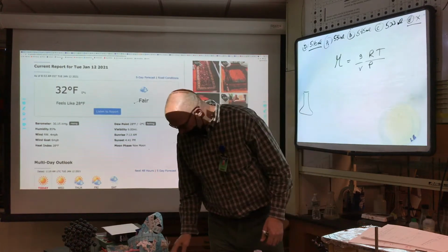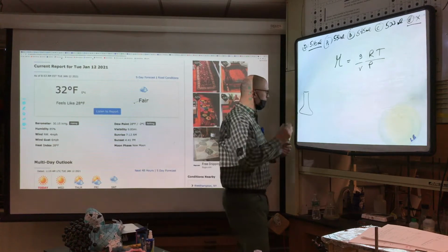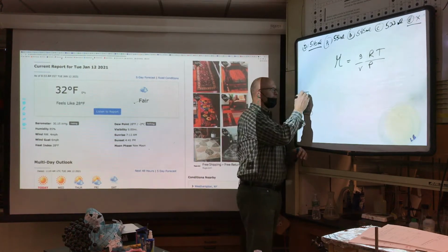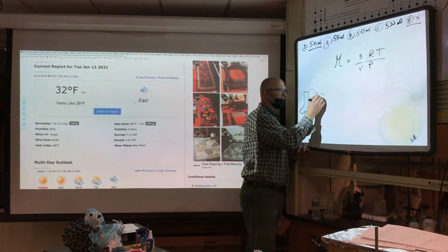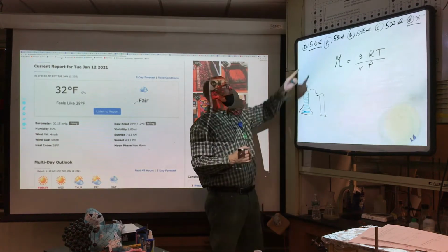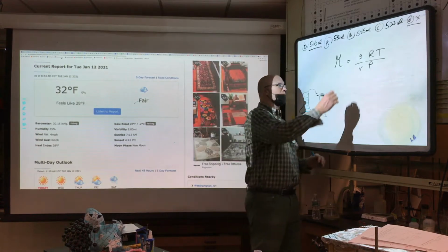It's green, but hey, maybe there's algae in it. In any case, they filled it up with water to the tippy top, and they poured it into a graduated cylinder and measured the volume of that space. The space of the water is the space the gas would fly in, and we have those values up there depending upon what flask you pick. So we have the volume.